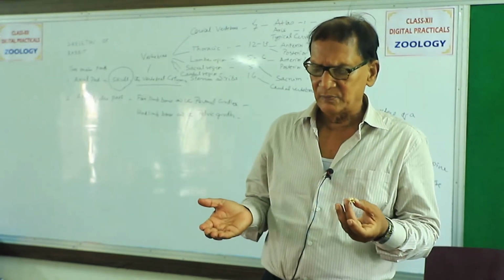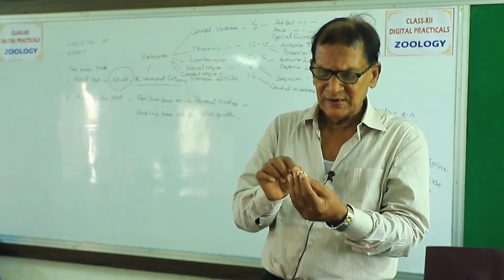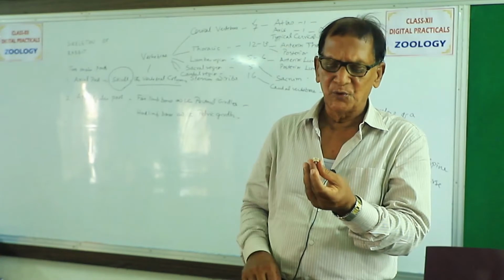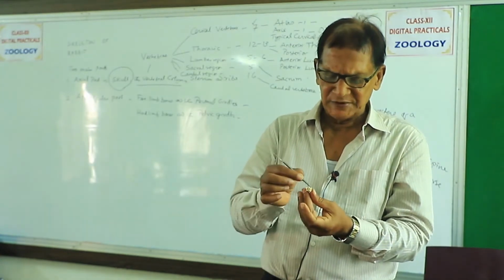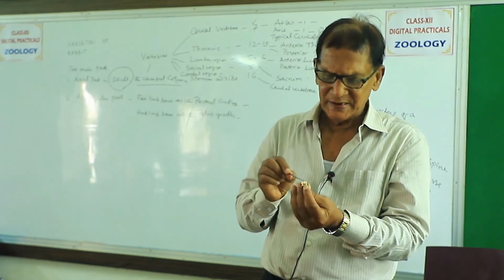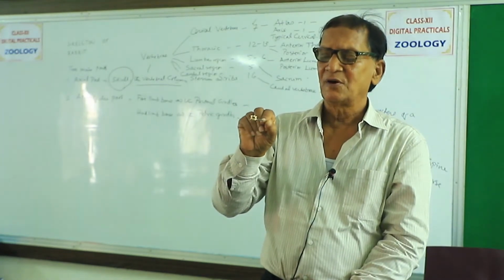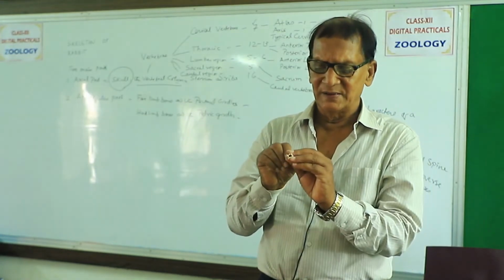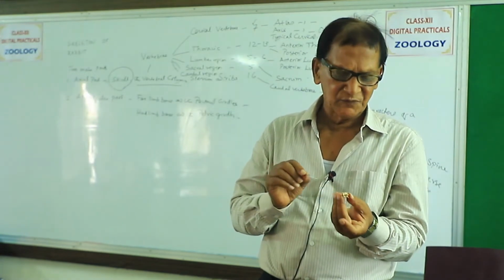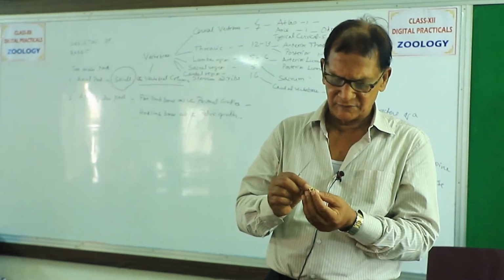Those that are present anteriorly are called pre-zygapophyses. They are directed upwards. So you see, these two are directed upwards. They are called pre-zygapophyses, and these two are directed downwards. So they are called post-zygapophyses. So a pair of pre-zygapophyses and a pair of post-zygapophyses. This is the reduced neural spine. Again, there is the vertebrarterial canal on the side. So all typical characters of a vertebra are present. That's why it's called typical cervical. So the next 5 cervical vertebrae after atlas and axis are called typical cervicals.